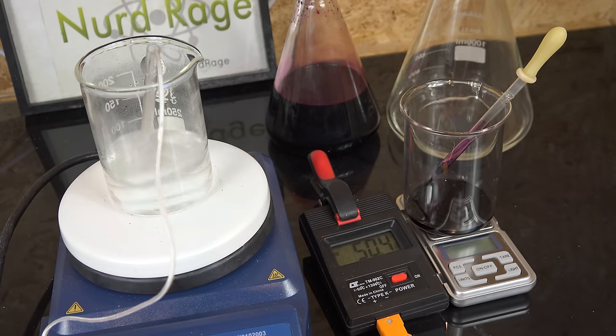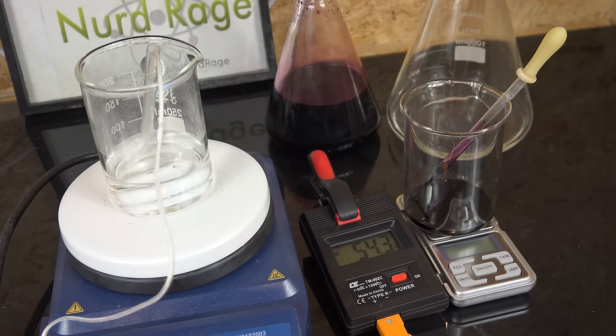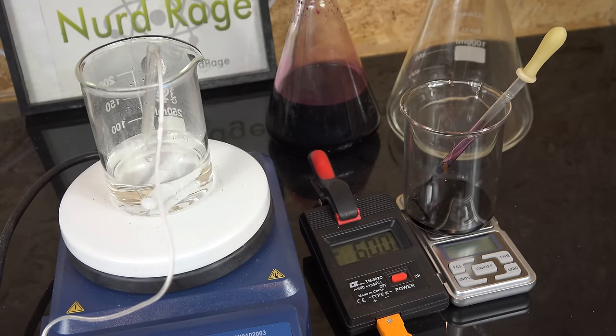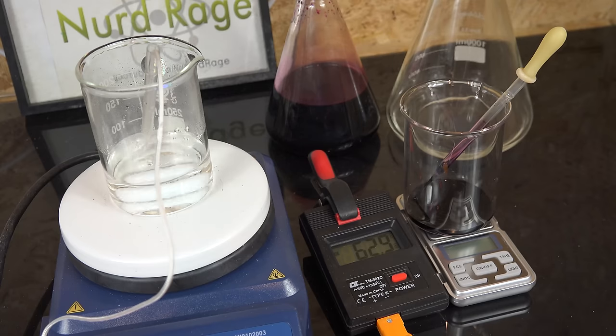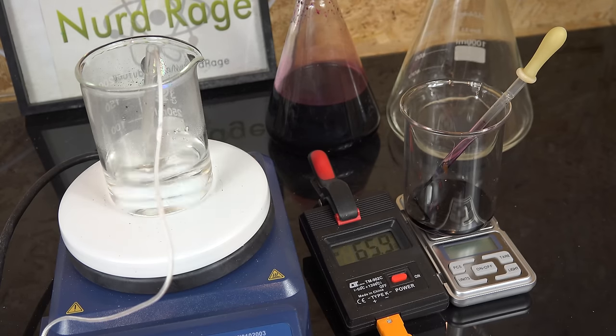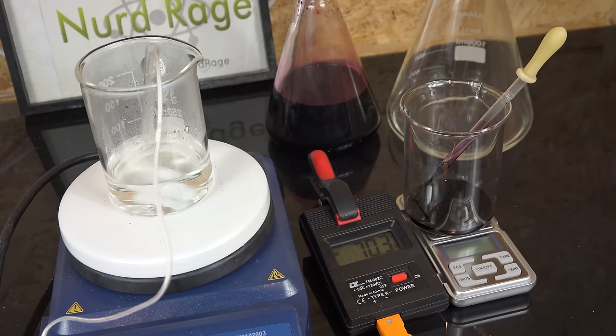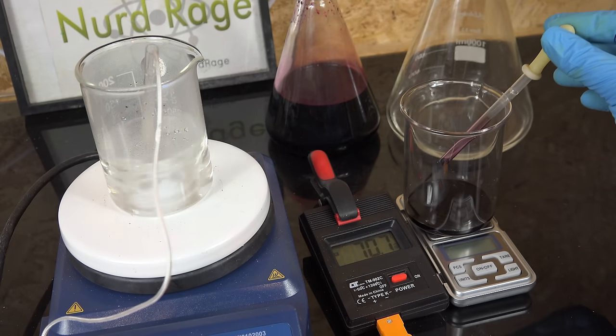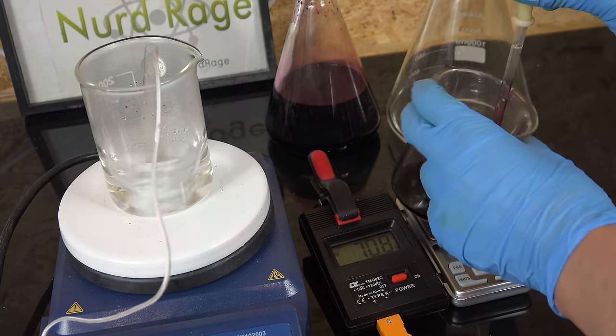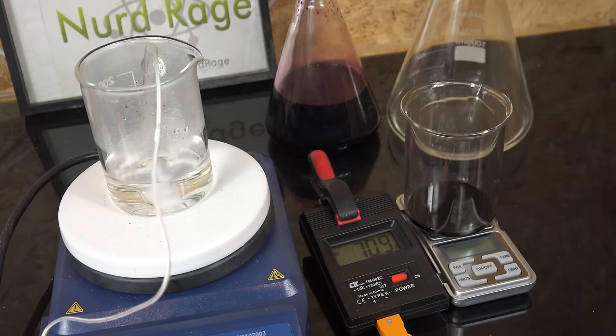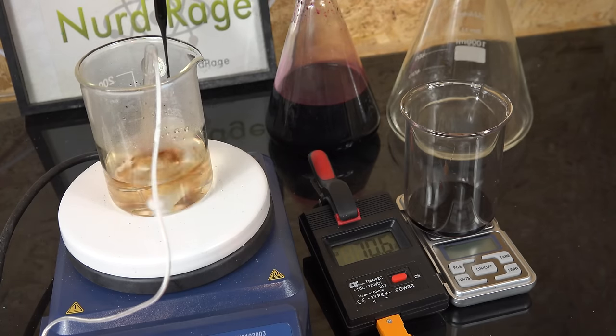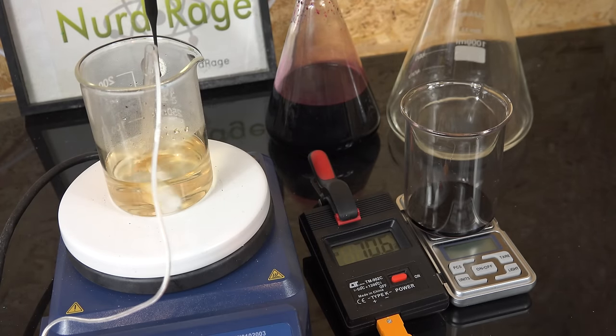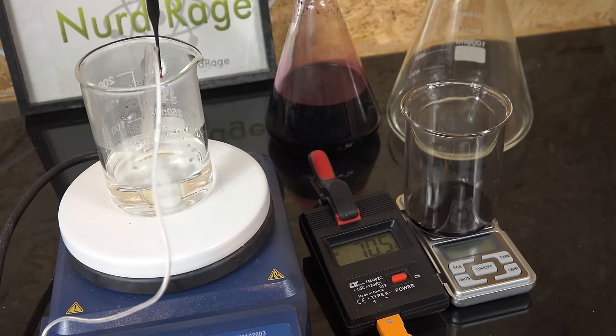You're absolutely right and this is one of the major points of trust we have as amateur analytical chemists. We need to trust that we made it correctly and that it's reasonably pure. Better than 99%. For now we're just going to have to accept this point of trust. Professional analytical chemists don't accept that. And instead they'll buy primary standard with certified purity and traceable standardization all the way back to a standards lab. The whole field of analytical chemistry and metrology is pretty complicated and beyond the scope of this video. But at least now you know where to look if you want to know more.